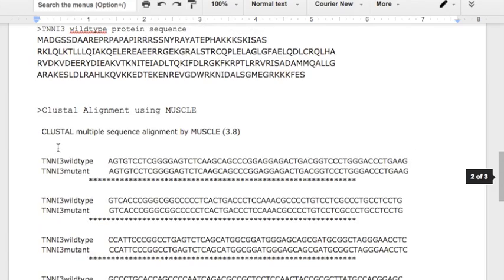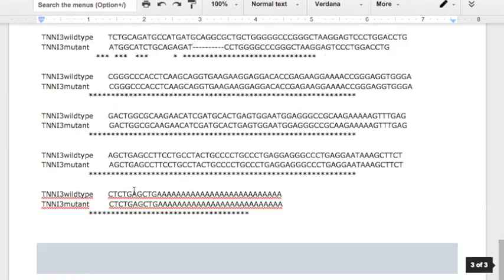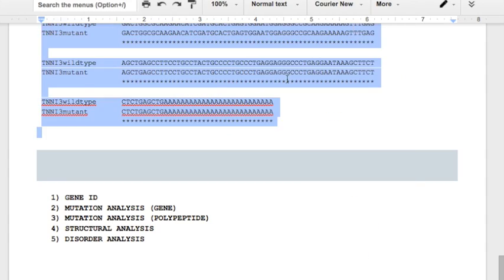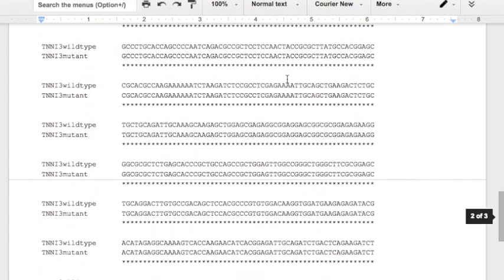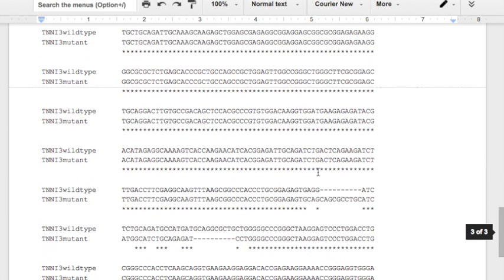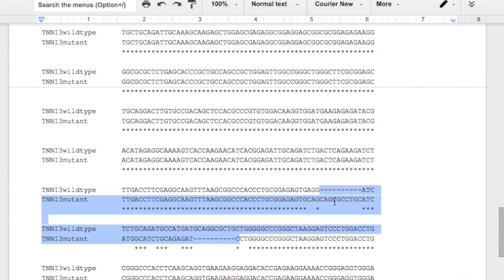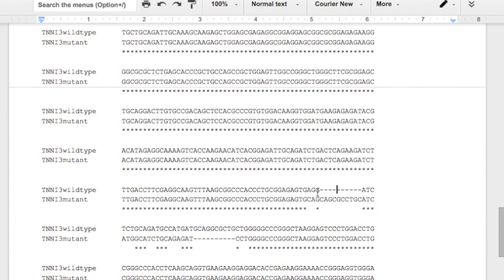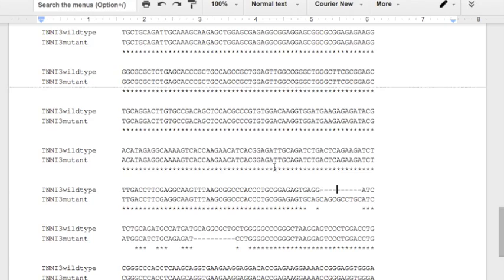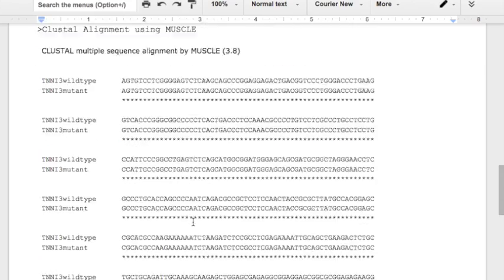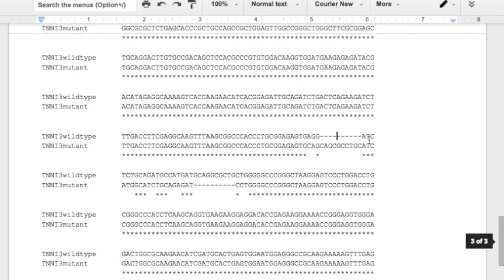If we take all this information and again convert it into courier, it will be a lot easier to compare. All right, our area that does not align is shown right here. What actually happened here, and this is not something that is easily identifiable, is this region of the gene was actually inverted. Again, this is beyond what you need to know. In your cases, your mutations will be something simpler. An insertion, a deletion, something of that nature, hopefully, or some sort of single nucleotide base pair change. Hopefully it will not be as confusing as this, which I will not bother describing in detail. But this would be useful for you to see the alignment and see exactly where the mutation exists.